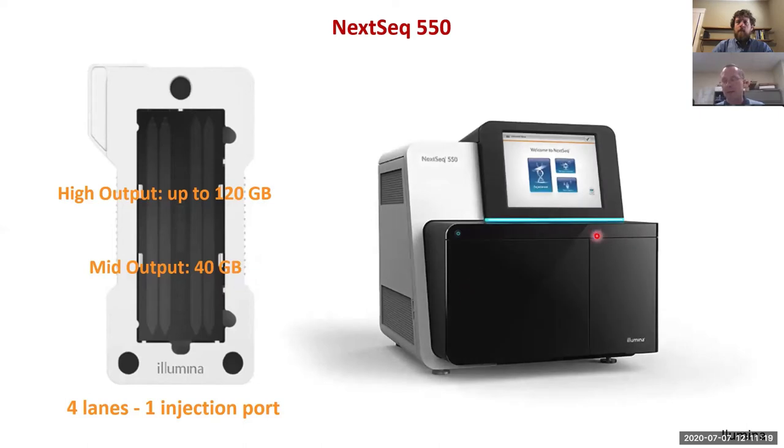This is how the sequencer looks. The flow cell is inserted here, there's a buffer chamber here, and a reagent cartridge here. This is a touch screen which runs the sequencer. Once it's started, it's running automatically. The data gets pumped to the Illumina cloud and from there it can be made available to the end user and enable sharing.